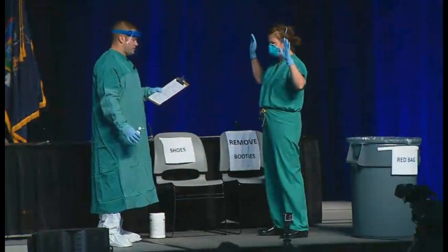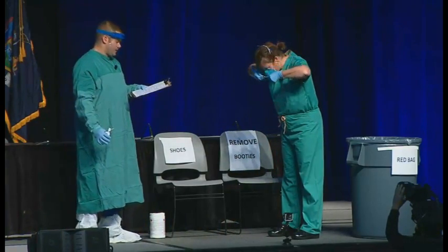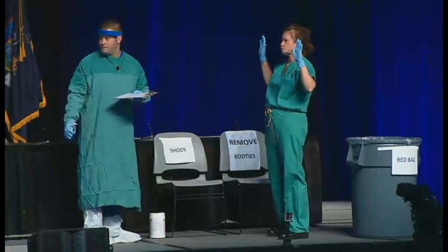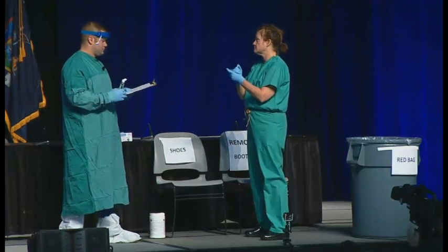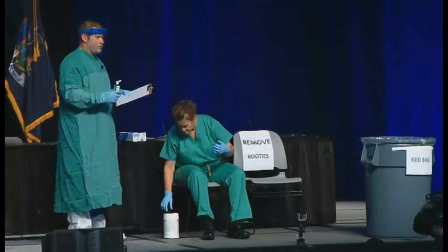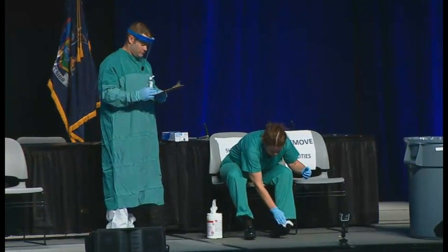Now Barbara is going to remove the N95 respirator by slightly tilting her head forward, pulling the bottom strap over her head, followed by the top strap, without ever touching the front of the respirator. That front of the respirator is the place where if contamination is going to occur, the risk is highest. So when you remove the N95 respirator, you don't want to touch that front part. Again, we're going to perform hand hygiene — margin of safety, margin of safety.